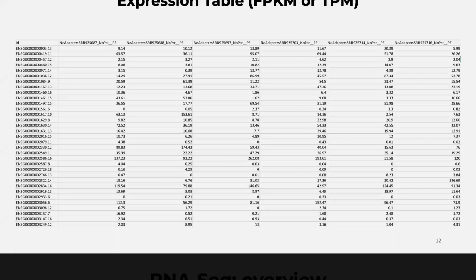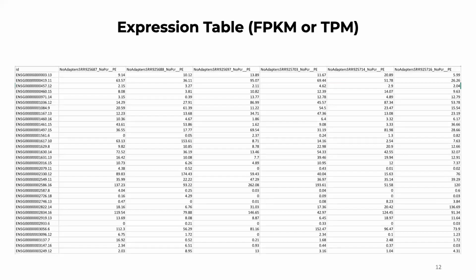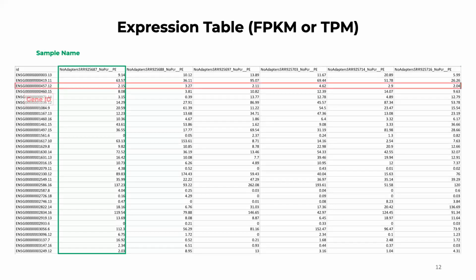Expression table, one of the things that we're going to be looking at today is a table of genes, which you see in your rows, and by sample, we know which gene has what kind of an expression. So if you did the assignment for yesterday, you probably noticed that visualizing the gene expression gives you a bar for each one of your samples. And the level of expression is that number right there.